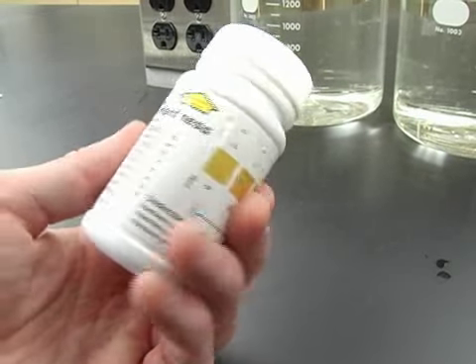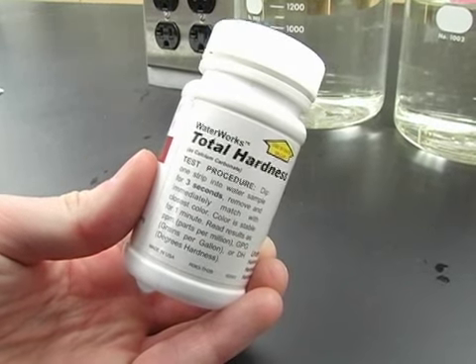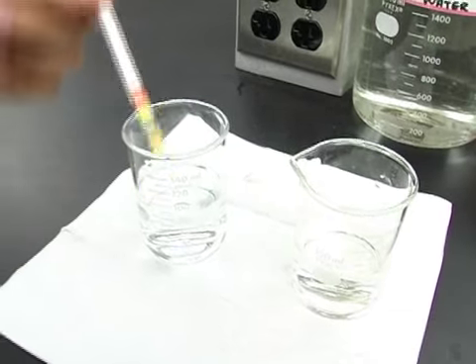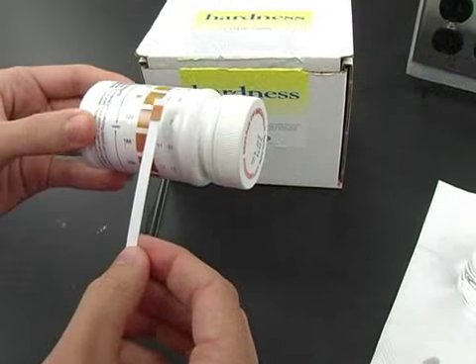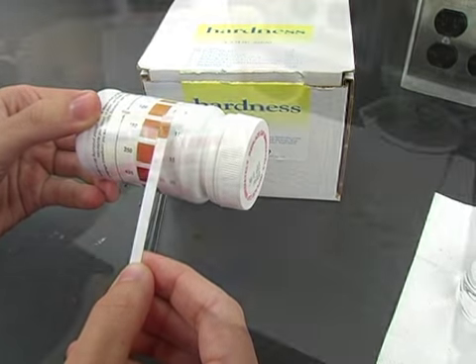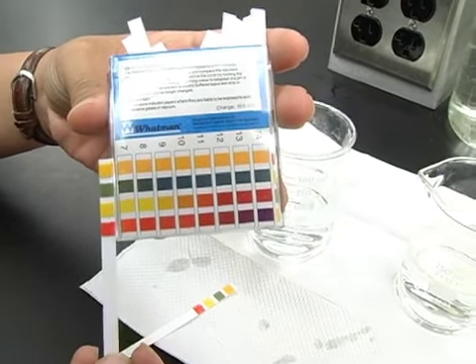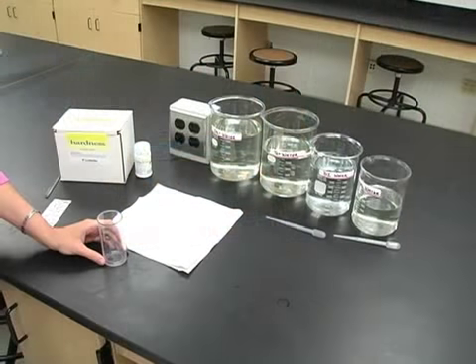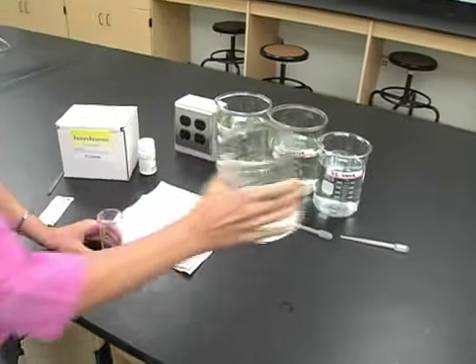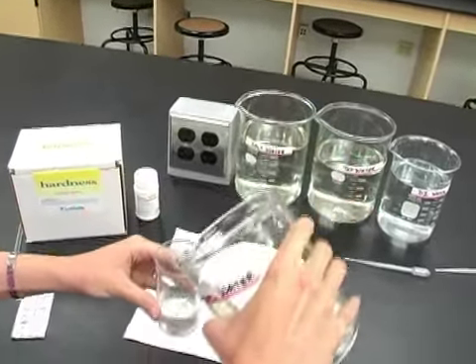This simply refers to the amount of calcium and magnesium ions in the water. These minerals enter the water system mainly by the leaching of rocks and soil. Calcium is an important component of both aquatic plant cell walls and the shells and bones of aquatic organisms, while magnesium is an essential nutrient as well as a component of chlorophyll. There are two methods used in this lab to test for hardness. The first involves a test kit.